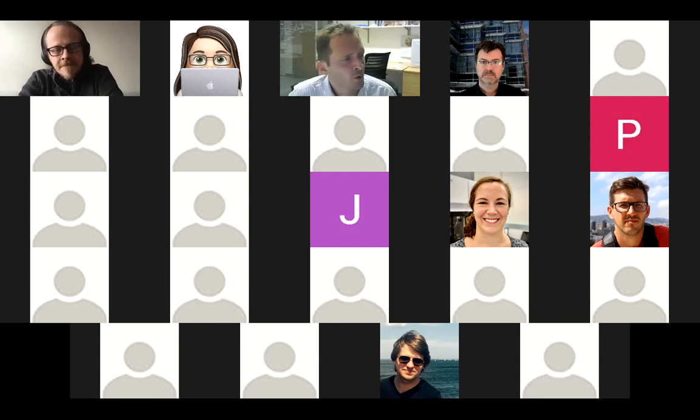Yes. So not in RELION 4, not in its GUI, but Dari has put our entire network on GitHub, and we've sent all the information we've used for training to EMPIAR. So there is an EMPIAR entry, or there soon will be. I don't know if it's come out yet, but it has all the 14,600 2D class averages and the metadata that we used for training. So one could then set it up, but it wouldn't be as straightforward as retraining Topaz like you now do in the RELION 4 GUI.